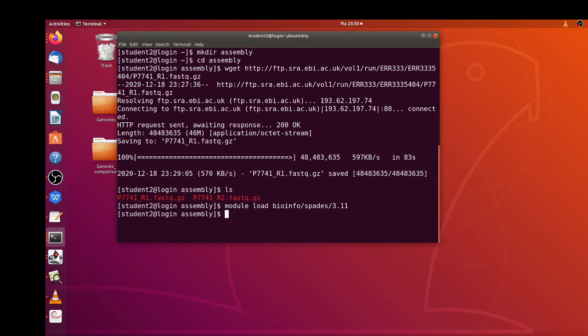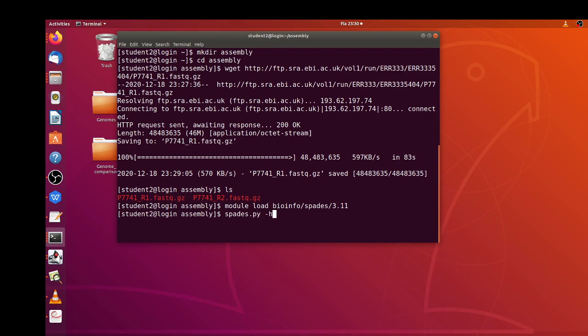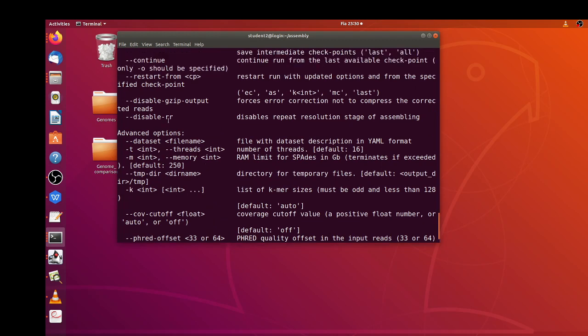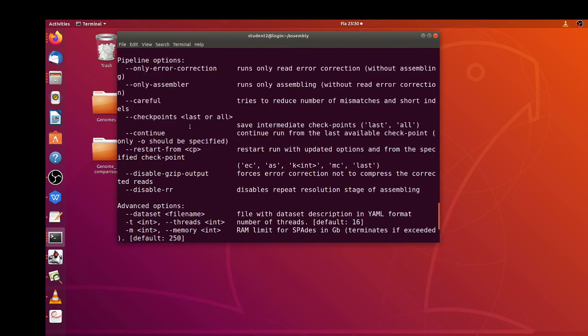Okay, so SPAdes has been loaded. Before we proceed, you can check the help command using spades.py -h. That gives you the help command so we have the various options and then what they mean.